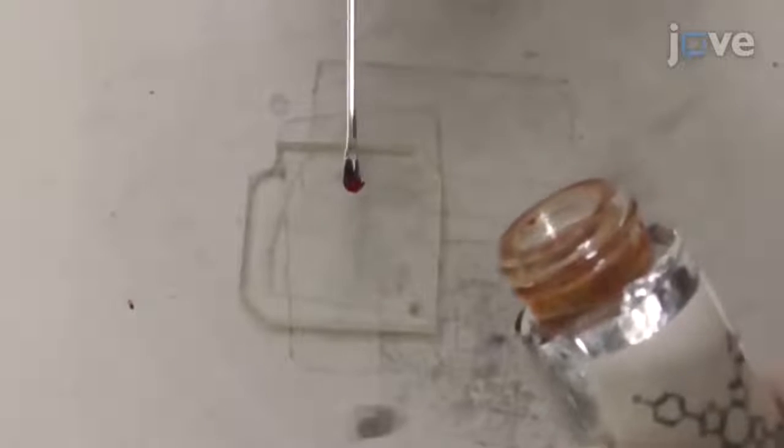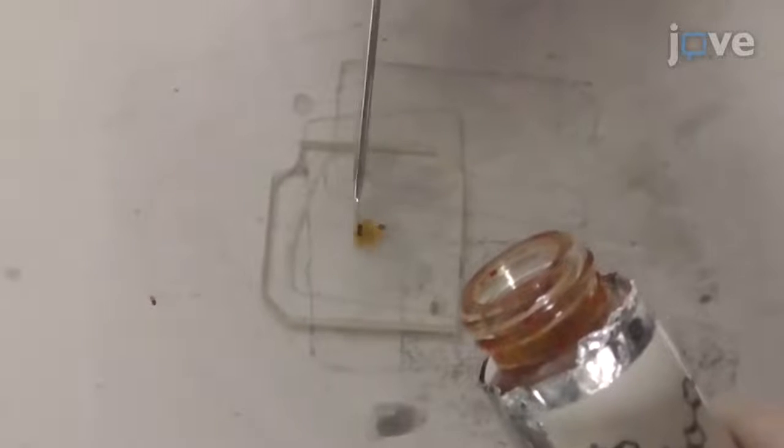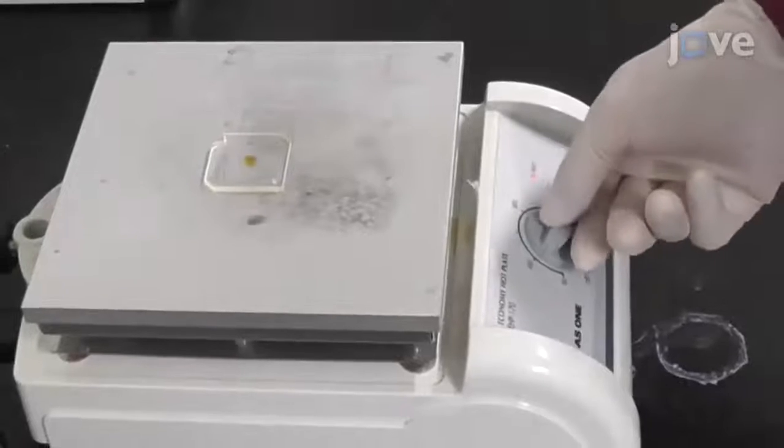To prepare a liquid crystal phase sample, cover a 3 mm thick calcium fluoride substrate in PiCO powder. Place the substrate on a hot plate and melt the powder at 100 degrees Celsius. Turn off the hot plate and allow the sample to cool to room temperature.